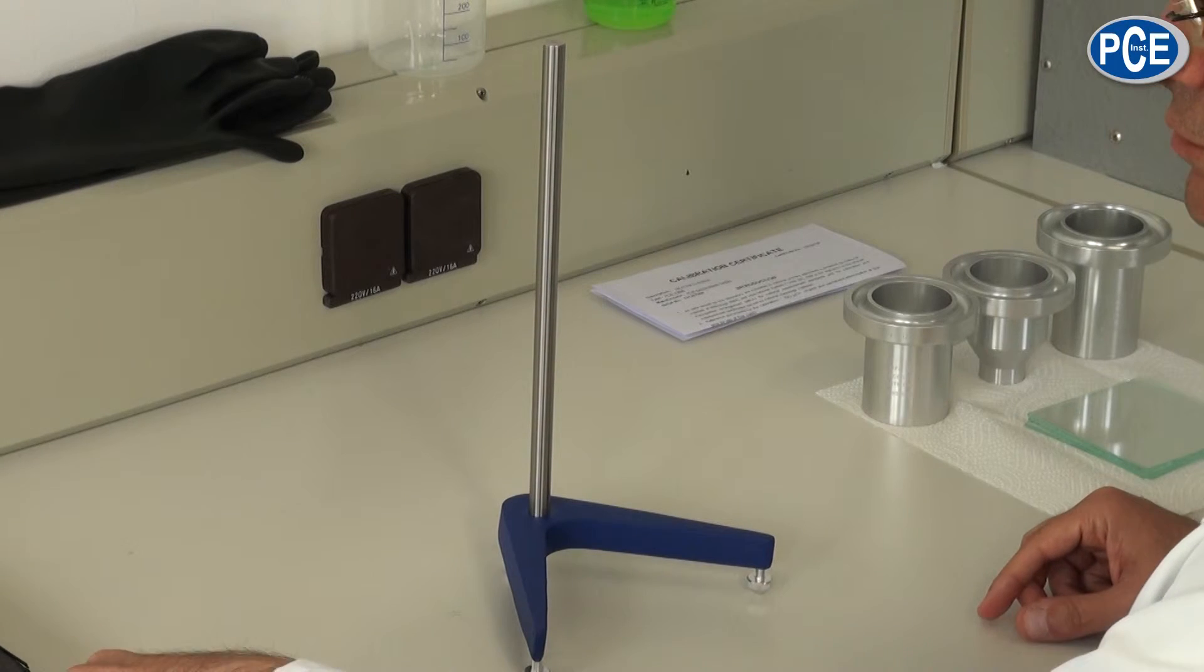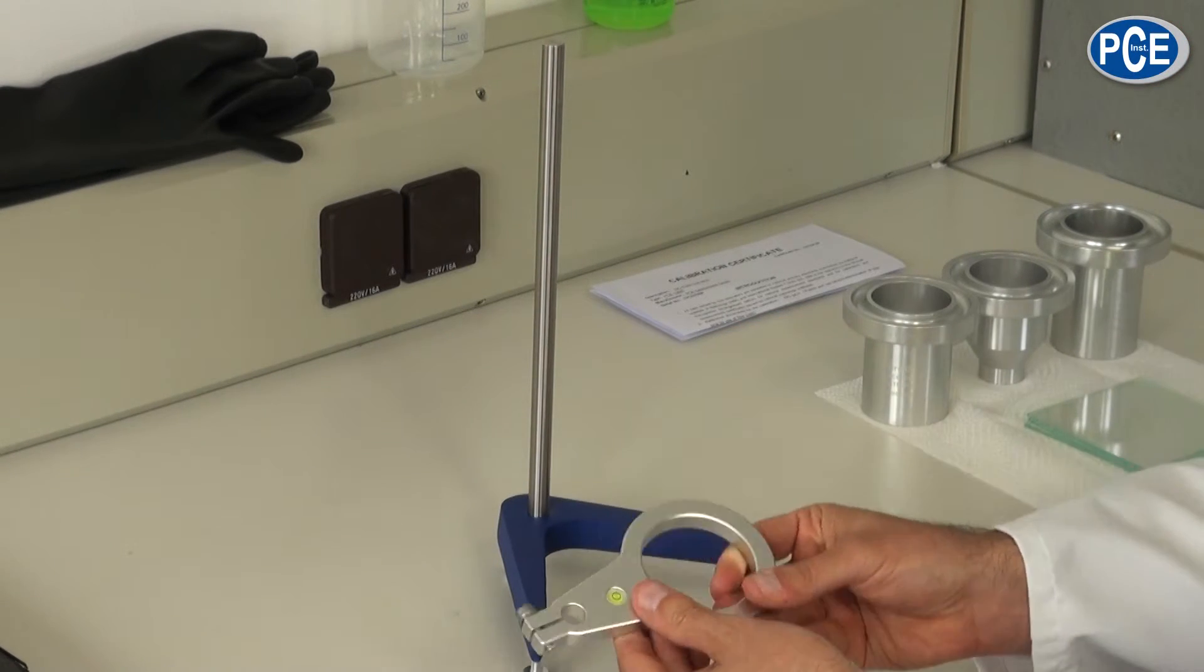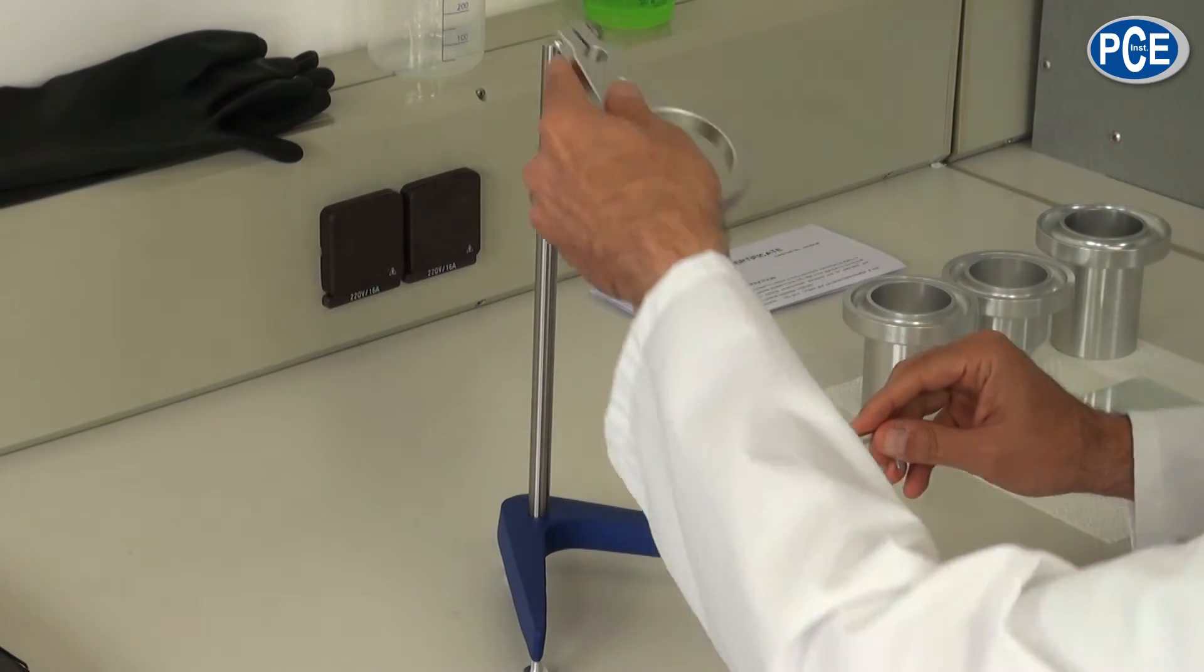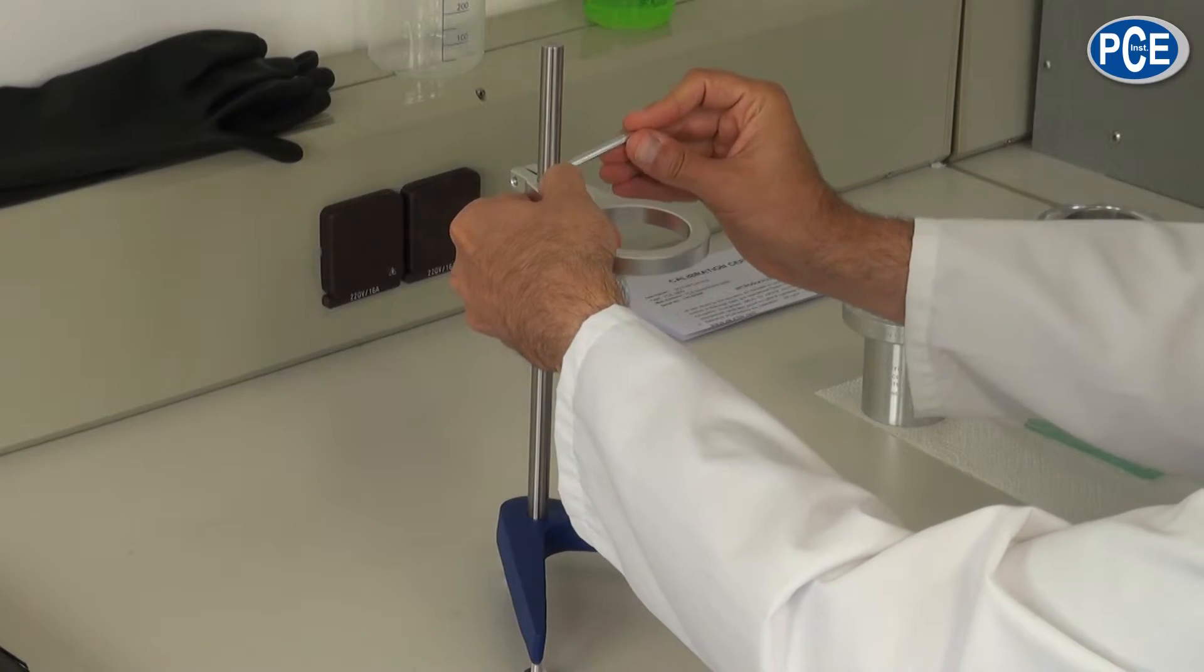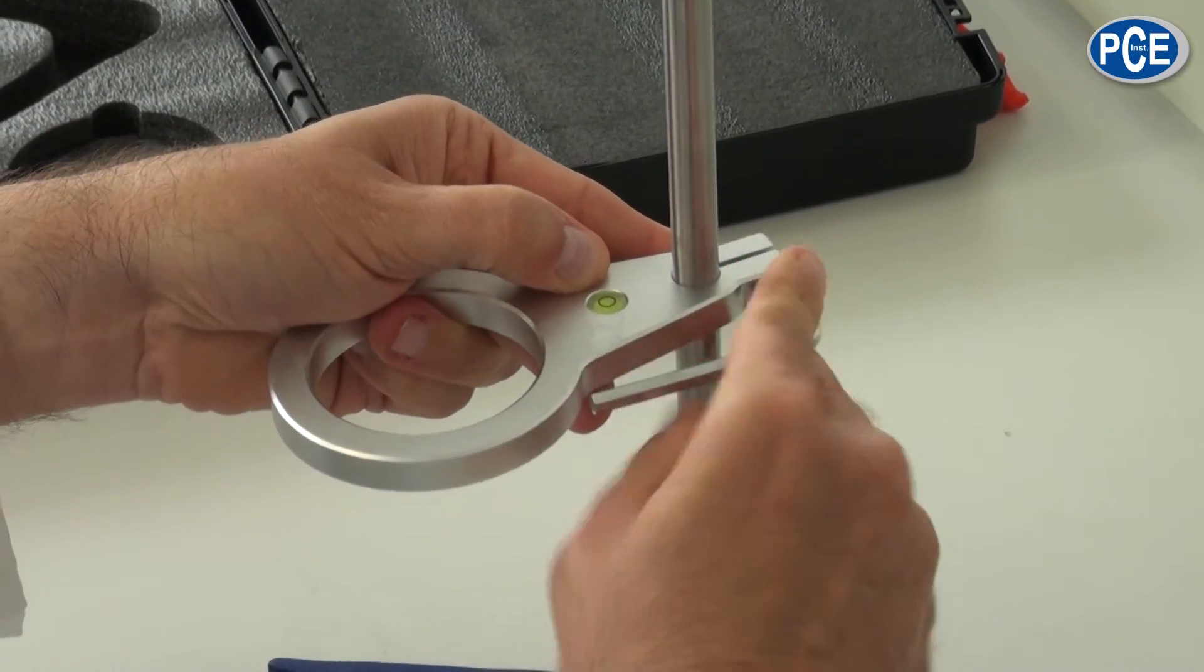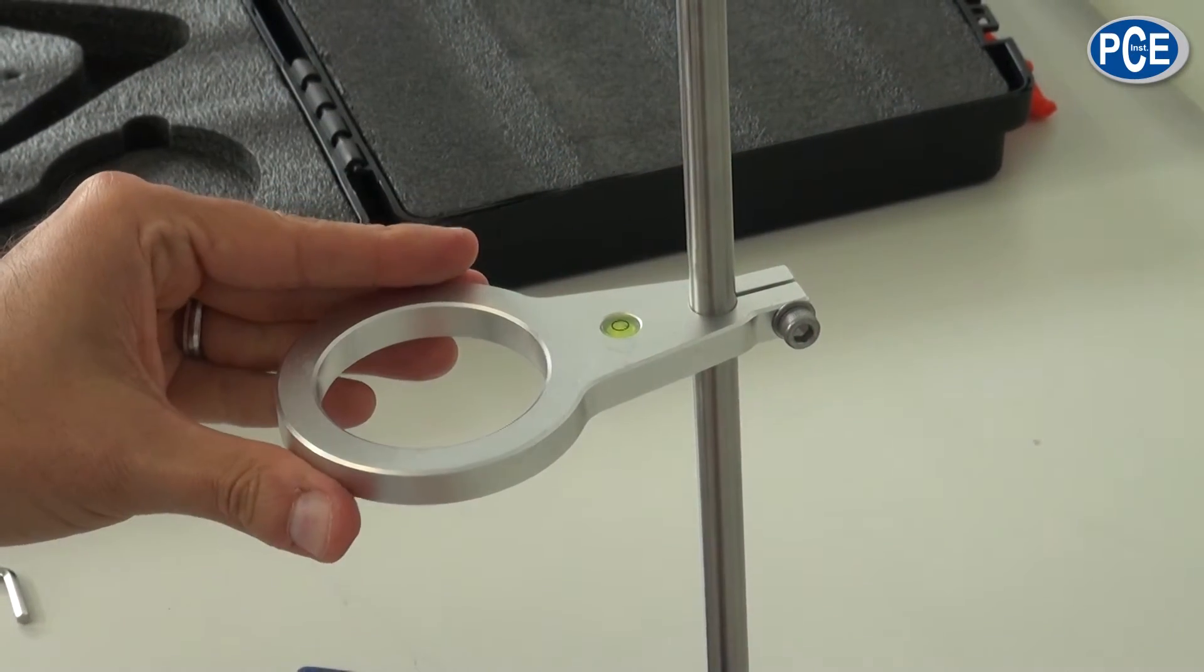Then the cup holder can be put on. The cup holder has a spirit level to level the cup. Now we put the cup holder on and fix it to the right height, and using the Allen key we tighten it up.